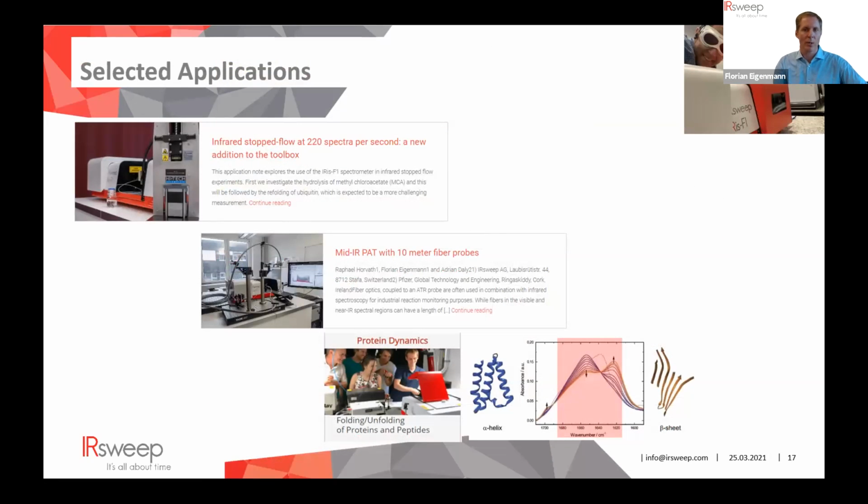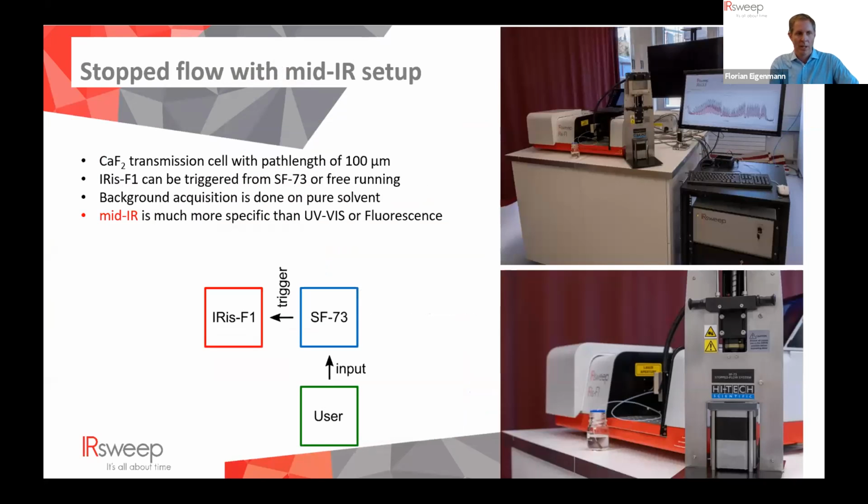The selected applications I want to highlight today before we go to protein dynamics are, first, stop flow, and the other one is mid-IR PAT, process analytical technologies, with fiber optics coupling using 10-meter fiber ATR probes. So first, stop flow, it's actually very exciting.